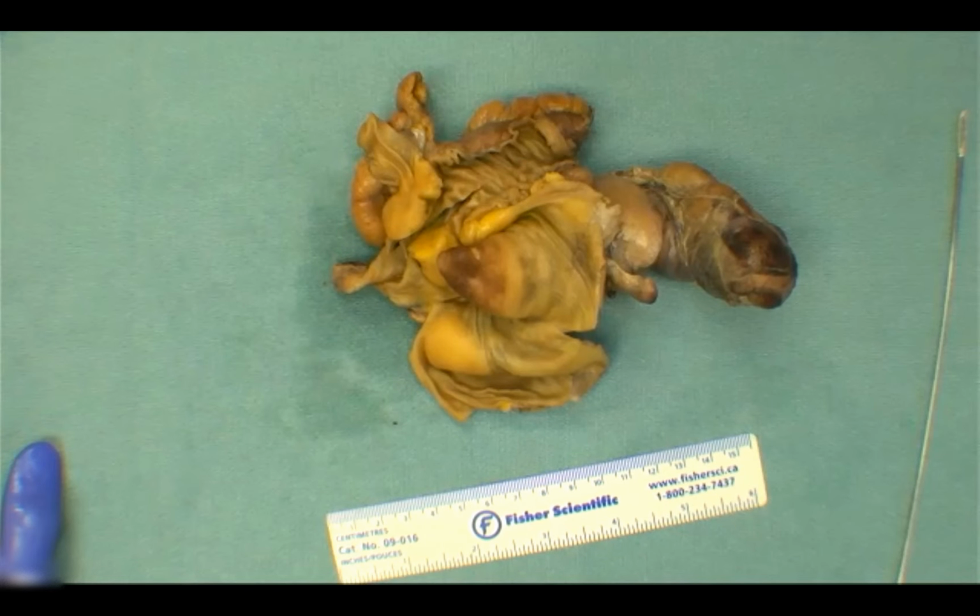Good. So I think it looks like the majority of people would actually put this through in toto. So what would your reasoning be for that? Why would you opt to put this through in toto? And in case anybody doesn't know, in toto means to submit the specimen in its entirety for histologic exam. Just the appendix. So what would your reasoning be? Okay, good.